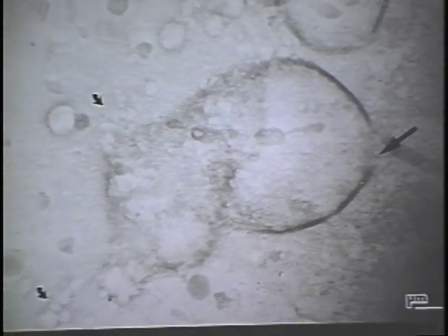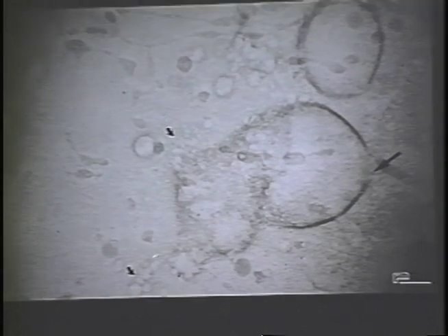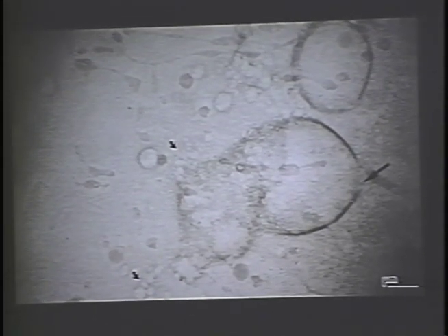On the left side, where the cell was spared such a high dose, one can see organelles, mitochondria, and a delicate cytoplasmic matrix. However, in the area of higher radiation, one can see blisters and bubbles and these larger structures. I have watched this damage happen before my eyes, and it starts out with these small blisters and bubbles, which then coalesce to these larger structures and holes in the cell. Next slide.